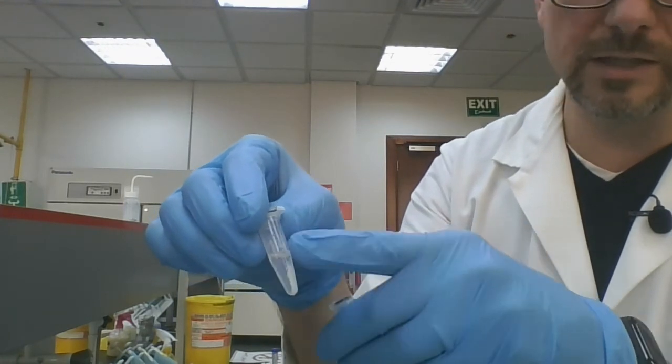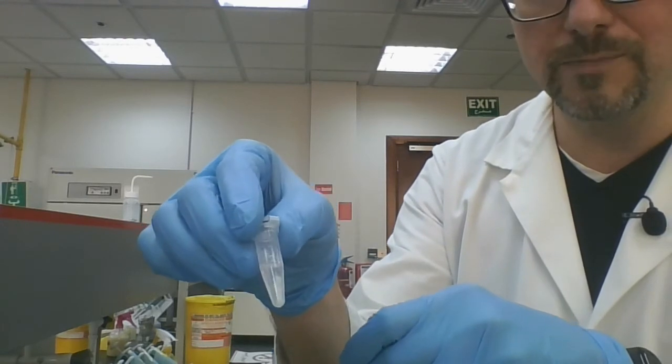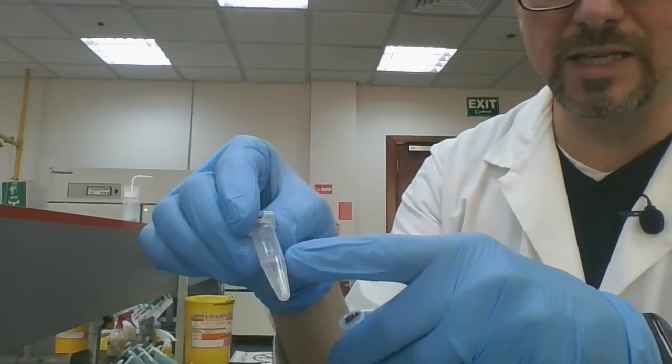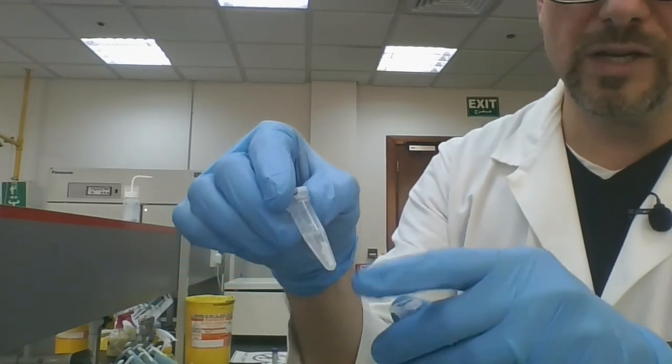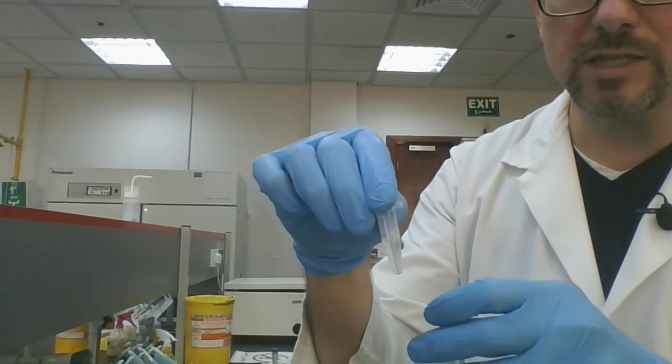So you can see very clearly here that it always collects on the side that's towards the outside of the centrifuge rotor, okay? And so if you put the hinge of the epi tube towards the outside, you will always know where to look for your pellet. Now, we don't really want to collect this pellet. We actually want to collect the supernatant from this. So we're going to be collecting the liquid. We're going to be transferring that into fresh tubes.